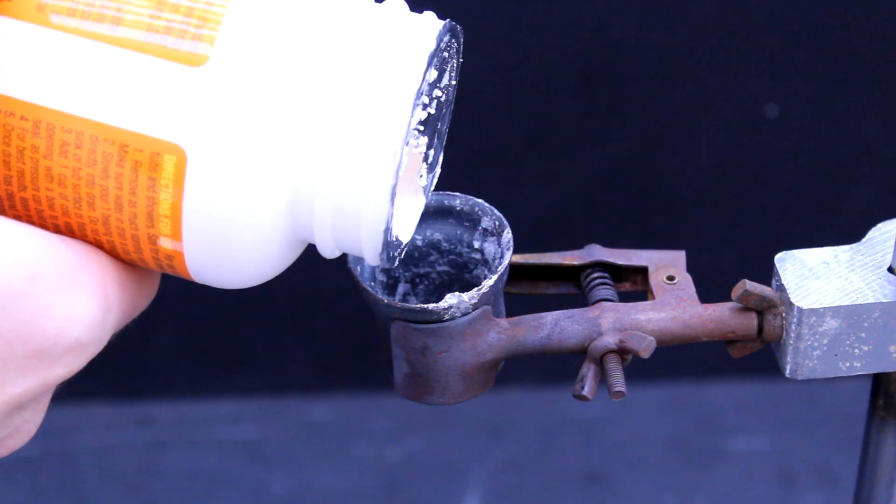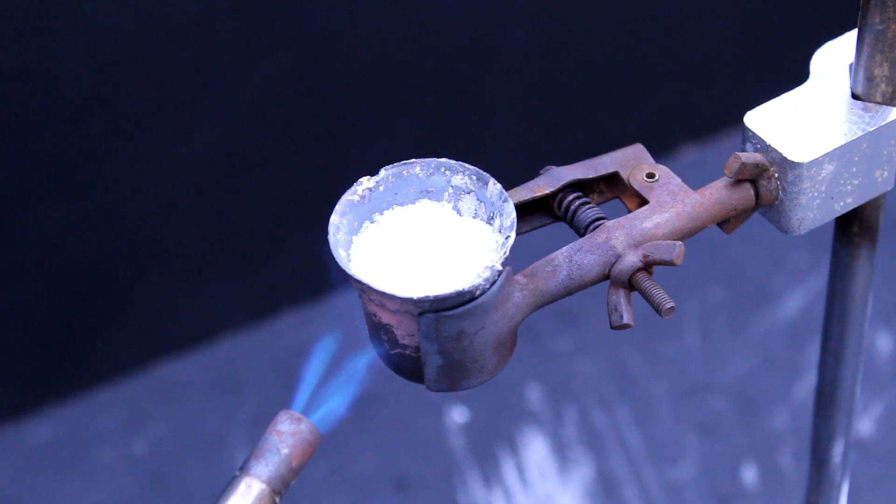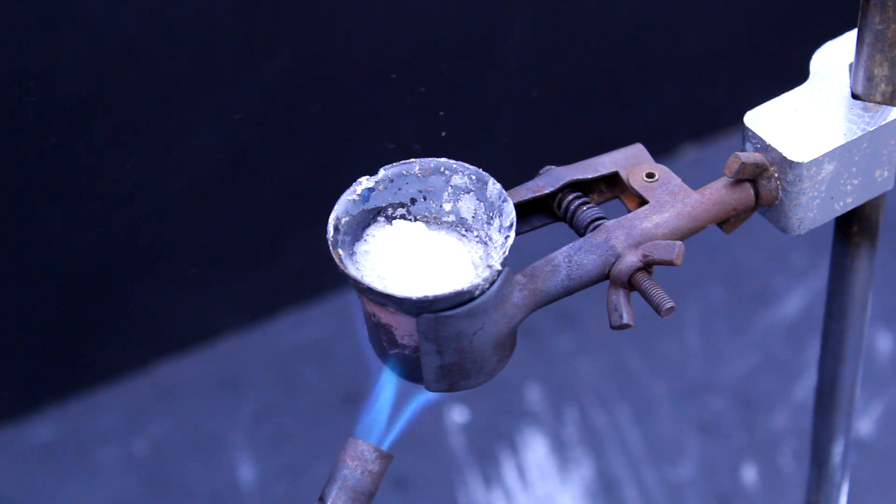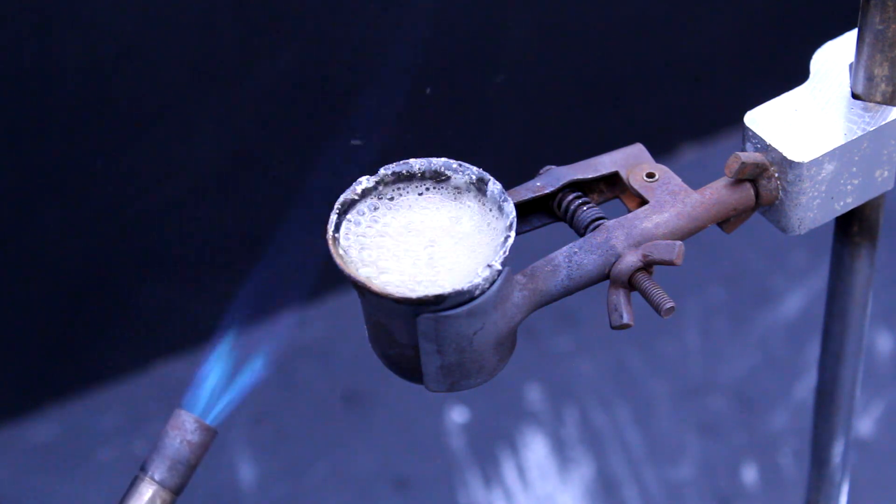To start, we will add an arbitrary amount of sodium hydroxide to the steel vessel. This is then heated with the torch until it melts. You can melt sodium hydroxide on a stovetop, but a torch is obviously much faster.